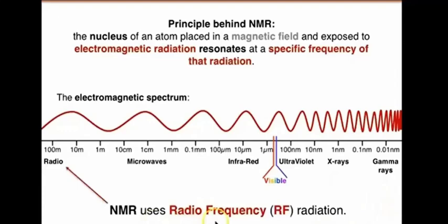Coming to the principles of NMR spectroscopy, we are using radio frequency waves. In short, RF radiations, which have longer wavelength, lower frequency and lower energy.